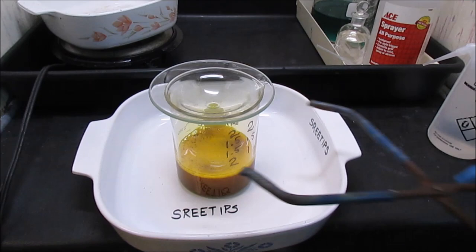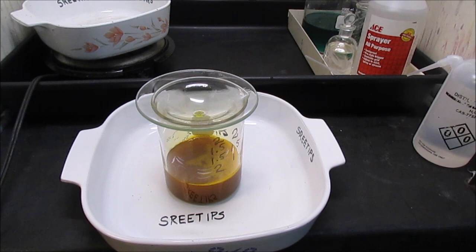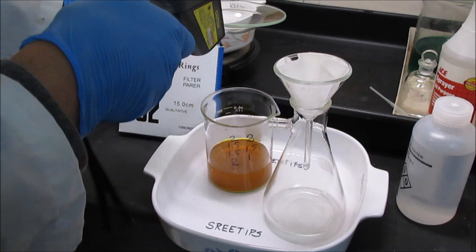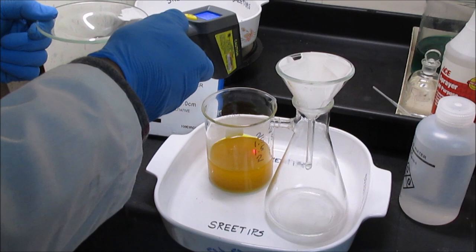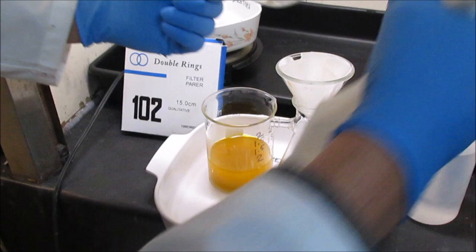All right, after an hour, it's down to 89 degrees. I'm gonna add a little chunk of ice here, cool it down a little further. Okay, the temperature of the solution is down to 74 now. I'm gonna go ahead and filter this out and see if we can get some gold out of this.